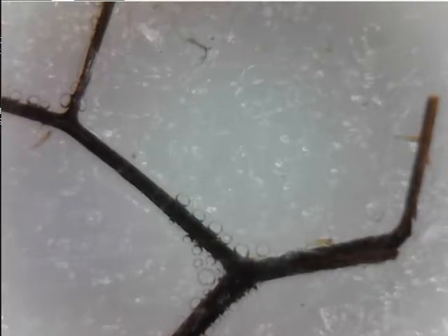But yeah, you compare that to that. With this, you, like, you see, as is expected of bugs, you see like strands - not strands - spikes pointing off in all directions. It looks serrated, almost. As almost everything made by - or, you know - made by bugs. Sorry, really bad joke. Anyway, as anything bug type. It's Pokemon. Sorry, again, I keep coming up with - I don't even tell jokes because I think they're funny to other people. I amuse myself by telling. Anyway. But, see, it looks serrated.